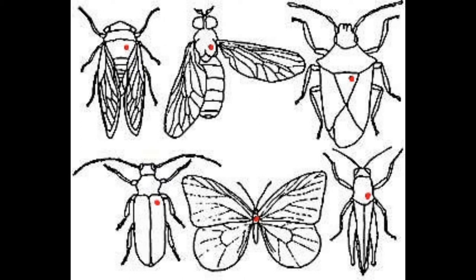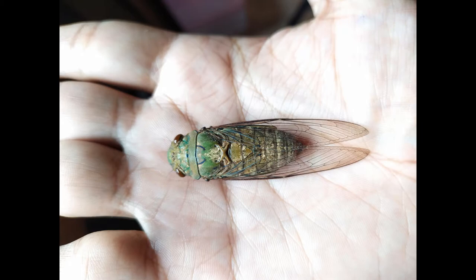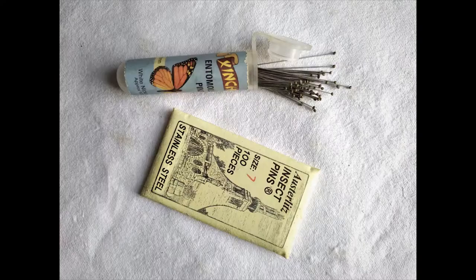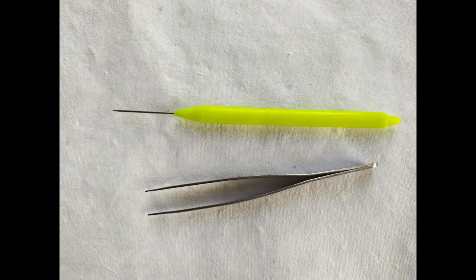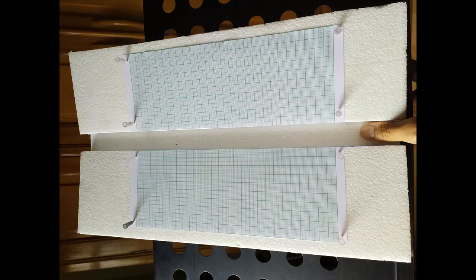In this video, I'll be showing you how to pin and spread a cicada specimen. For pinning a cicada, you'll need the following: a cicada specimen, either freshly caught or rehydrated; insect pins, in this case a number five or number seven pin; tweezers and pins; butter paper strips; scissors; and a spreading board, ready-made or homemade, with a wide central groove that can accommodate the abdomen of the cicada. The spreading platforms of the board contain two sheets of graph paper with grid lines to aid in the symmetrical spreading of the wings.